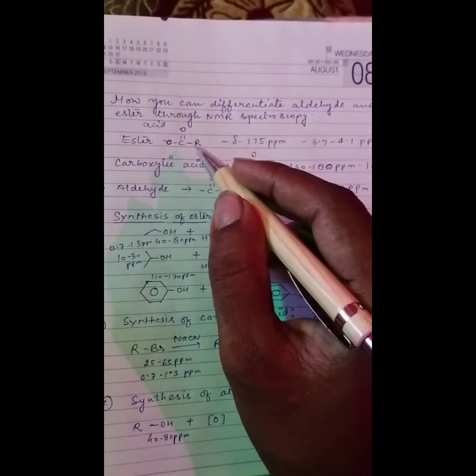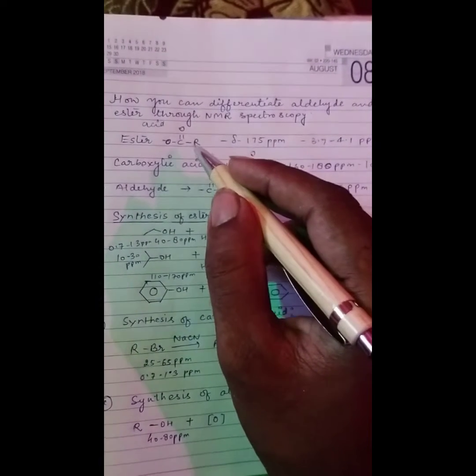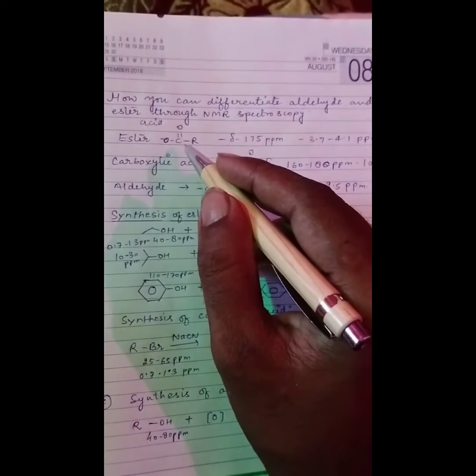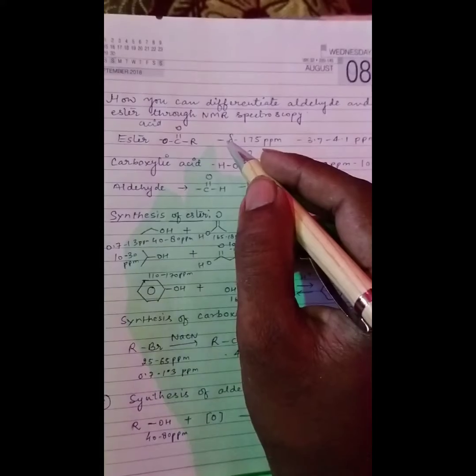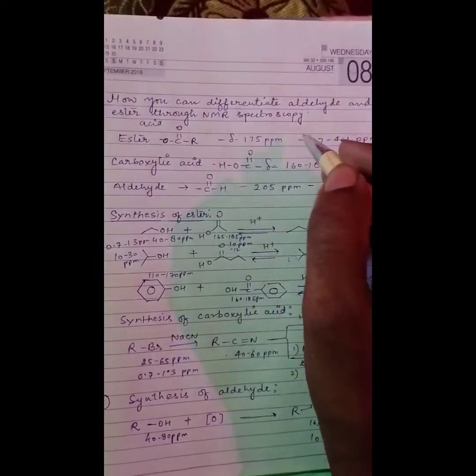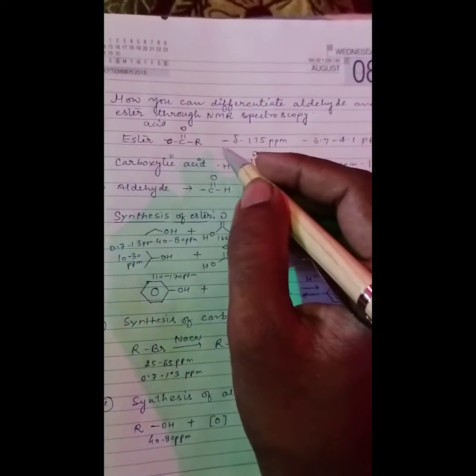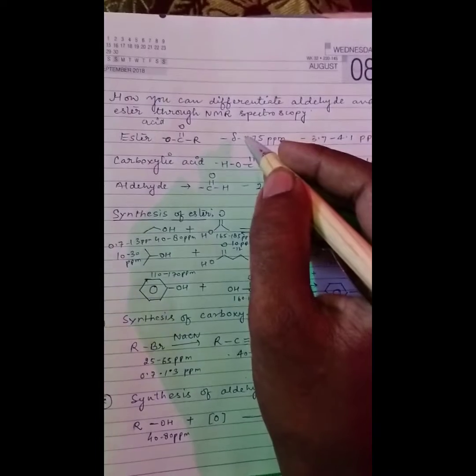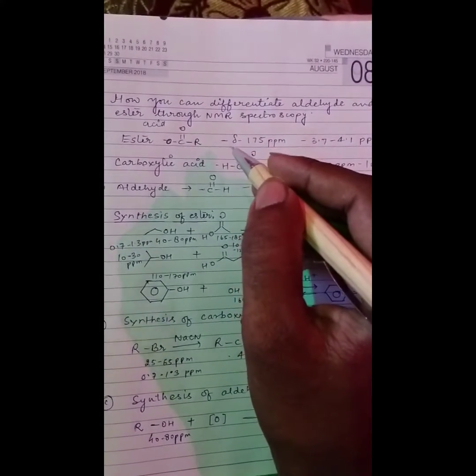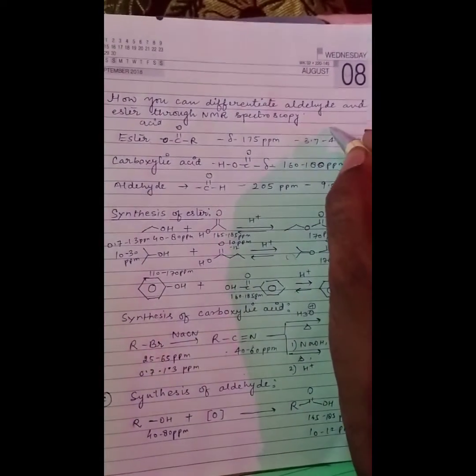the starting material, meaning the NMR of the starting material as well as the product NMR. You should know what the delta value of C13 is, and what the delta value is in proton NMR spectroscopy, by which you can differentiate, because in the lab you will synthesize this. So for your precursor as well as the compound, you should know the NMR spectroscopy regarding these compounds.